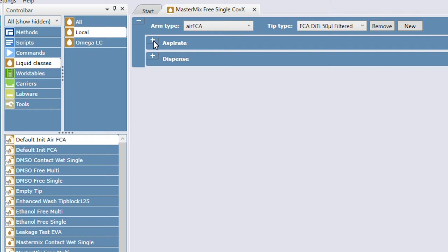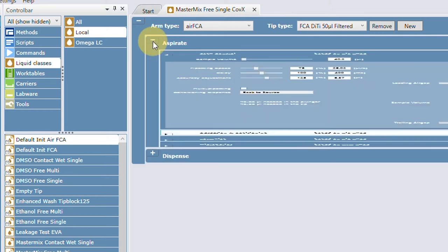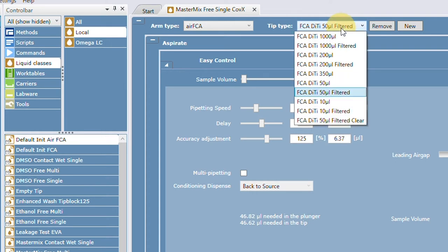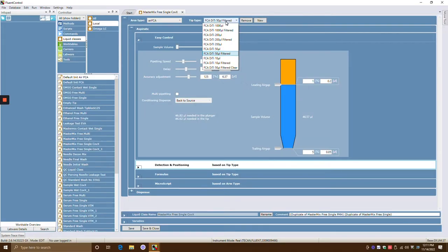The liquid class is broken up into two sections: the aspirate section and the dispense section. Keep in mind, every time you make modifications to aspirate and dispense — and this is a really common error — it's just for the tip that you select. Meaning if you need to change it for three different sizes, you're going to have to change it for three different sizes. I can't stress this enough: it does not apply to every tip volume.